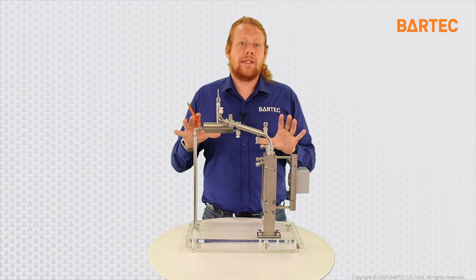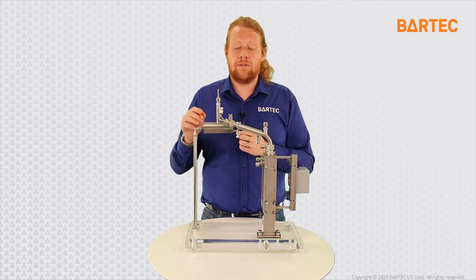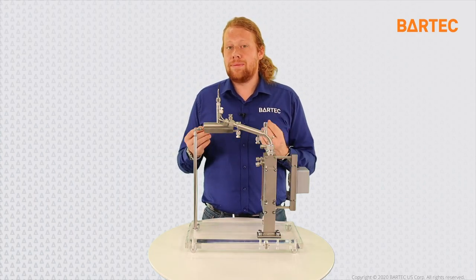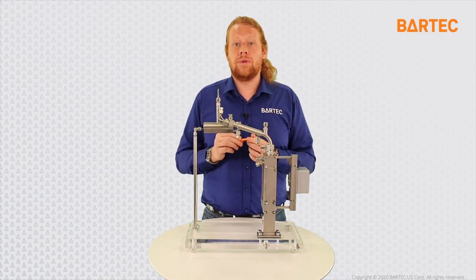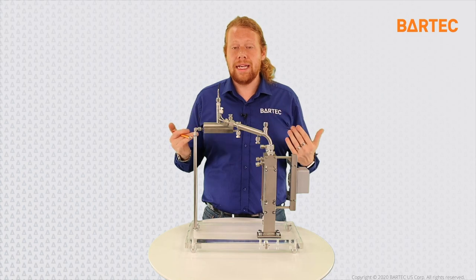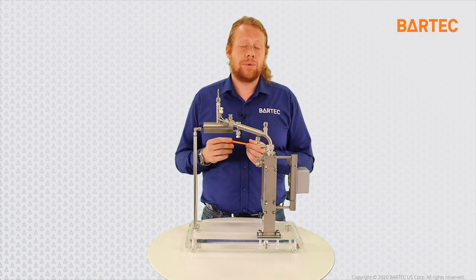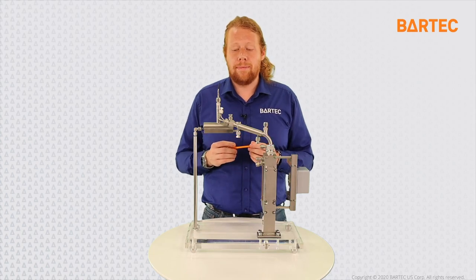So in the rapiDist-4, we have a built-in auto decoking function that allows us to extend the life of the evaporator. What this does is turn on the barrel heater to a very high heat setting, thus removing as much of the deposit as possible. With this being said, this is not a fix-all solution, so at some point, the evaporator needs to be replaced so that we can start with a new, fresh surface. Now, the entire analyzer has other maintenance needs, but as far as the measurement cell is concerned, these are the only two components that will require, I wouldn't say regular, but at some point, some maintenance.